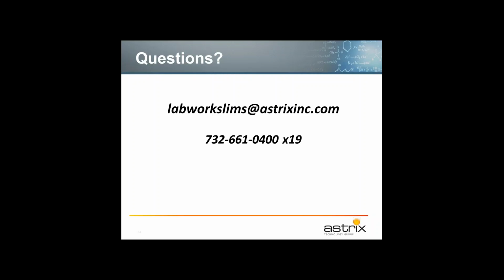First one says, you've talked a lot about Crystal Reports as the reporting tool. Does LabWorks use any other type of reporting tool, or is there an option to use any other ones other than Crystal?